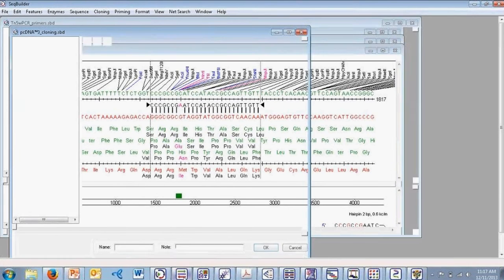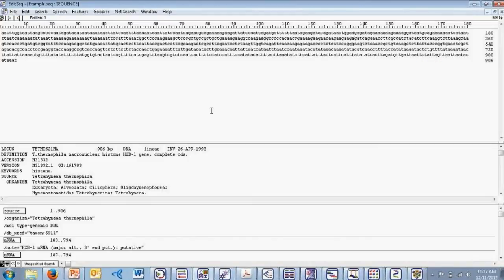Moving on, this is our EditSeq application — another legacy program with much of its functionality also having been replaced by SeqBuilder. However, we still include this application because it can be useful as a basic sequence editing tool and for importing and editing some less common file formats. This wraps up our discussion of the applications within the cloning suite: SeqBuilder, Primer Select, and EditSeq — all included within all the subsequent suites we discussed today.